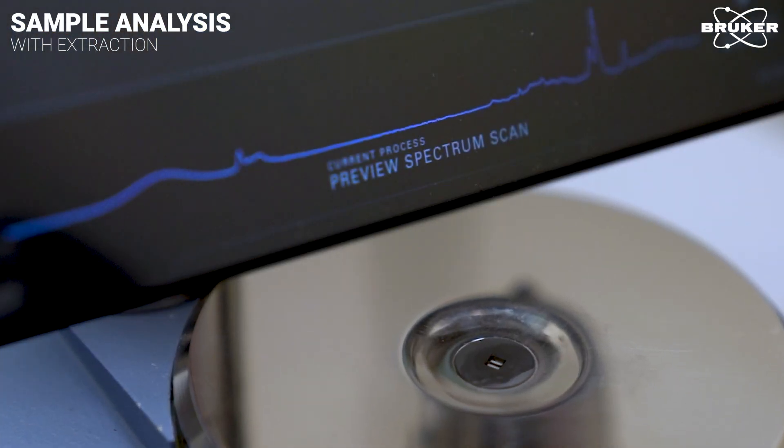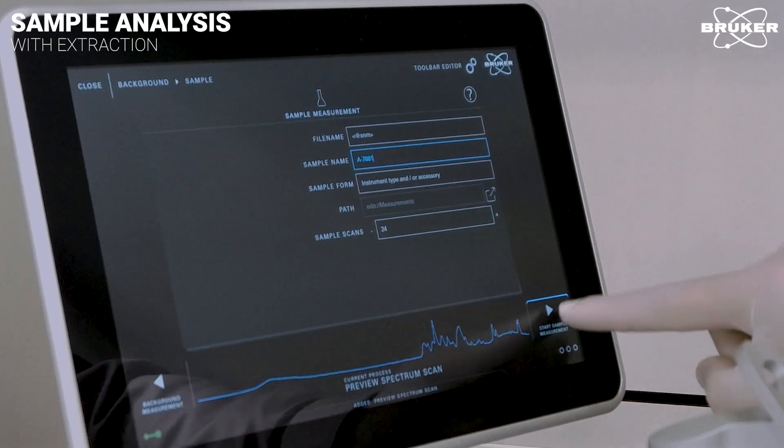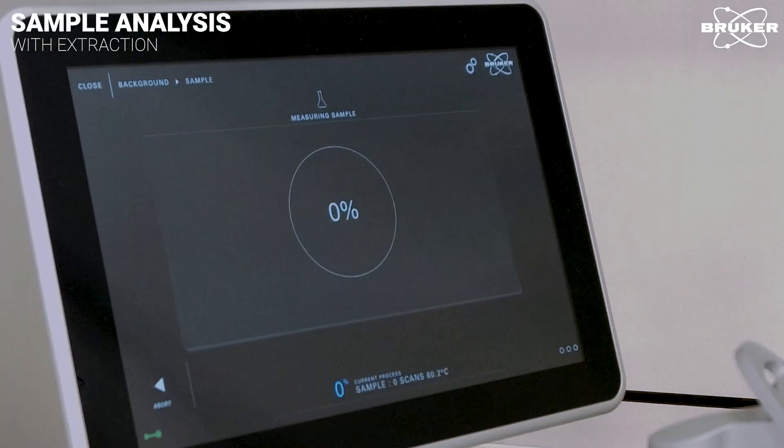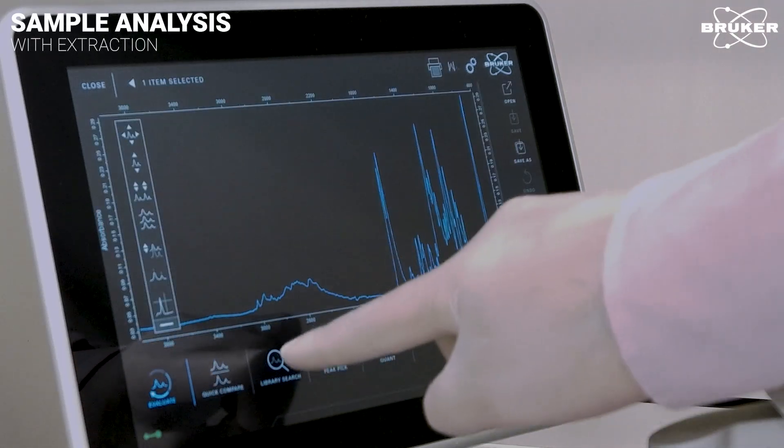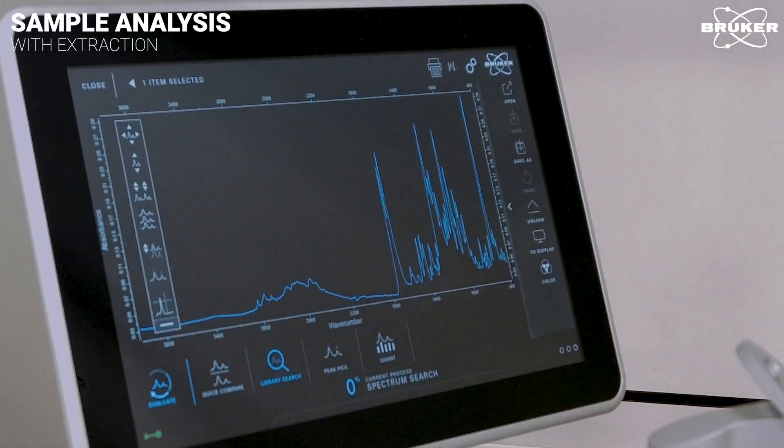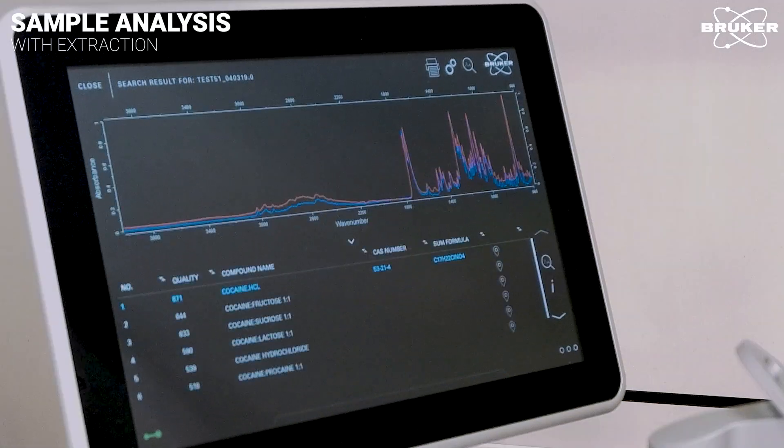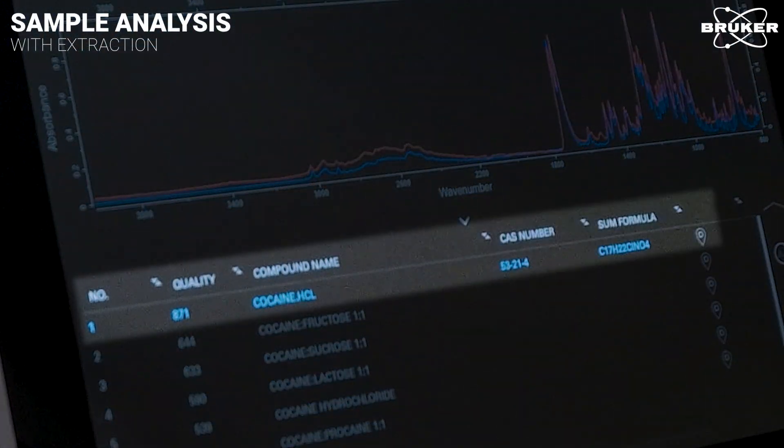The IR preview lets us know when the solvent is completely evaporated and we can start the measurement. Now, all it needs is one click. After analysis, the IR spectra window opens and by performing a library search we get the result. Cocaine hydrochloride.